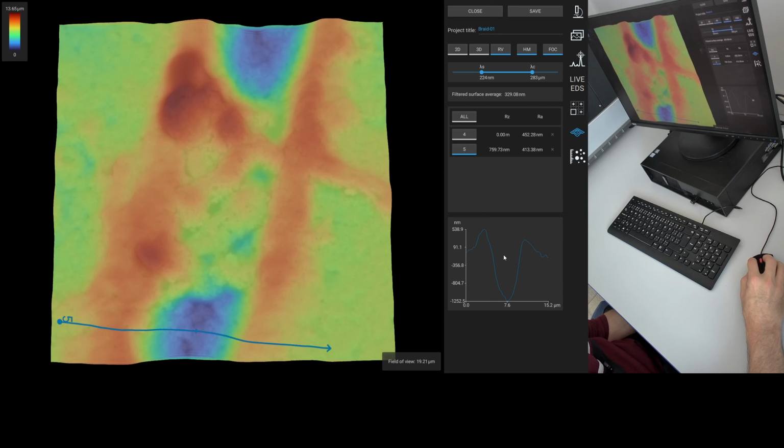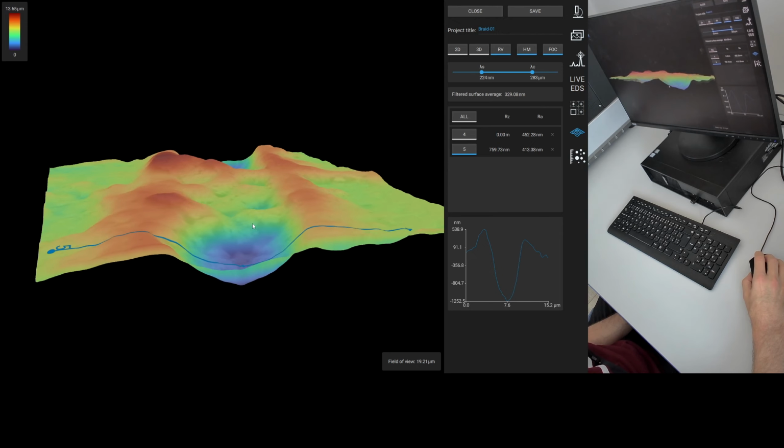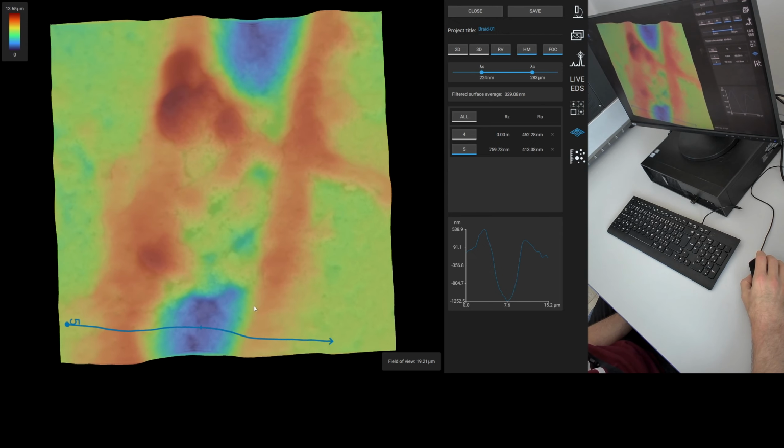Okay. The base level here is at, let's say, 90 nanometers maybe. And then it's gone down 1,150, let's say 1,160 nanometers. So 1,000. Is that a micron? I don't know. Look at that. That is deep. Now, is it similar up this end?